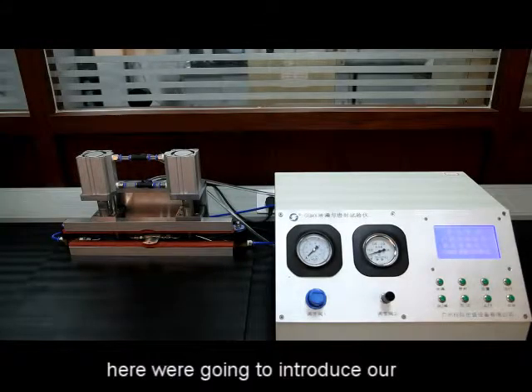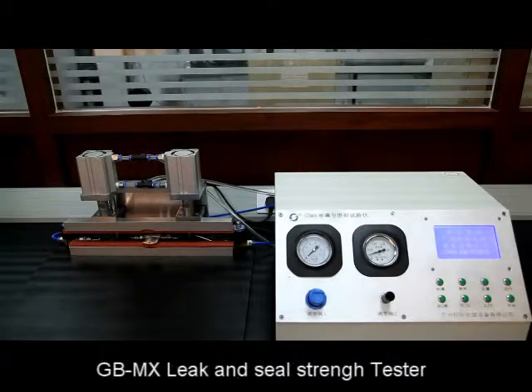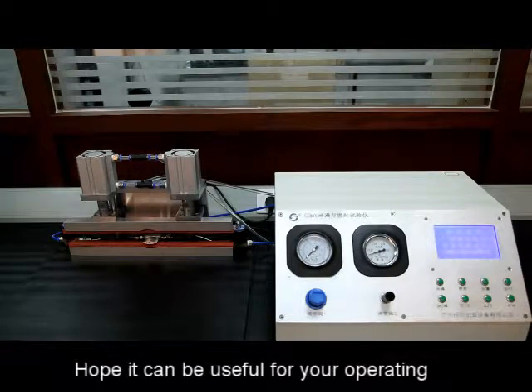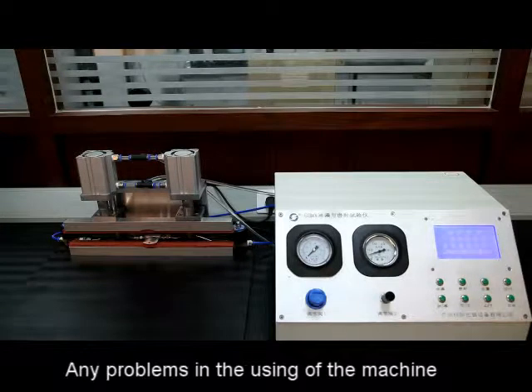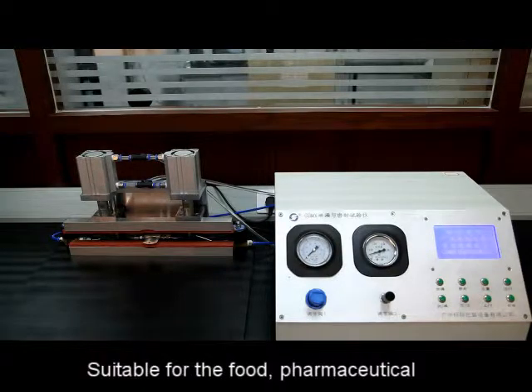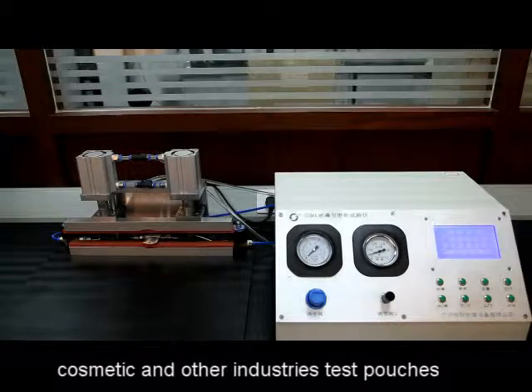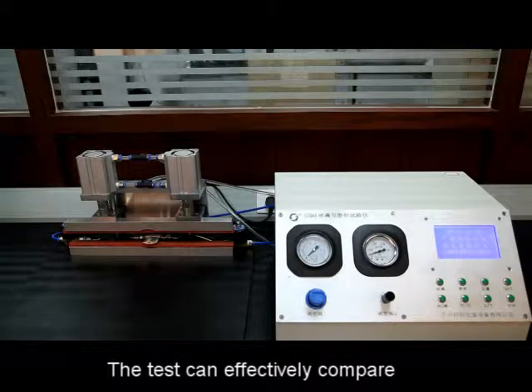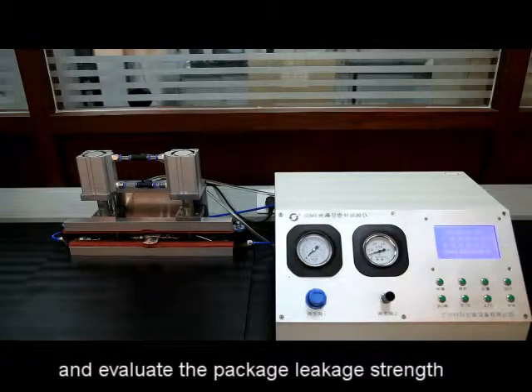Dear customer, here we are going to introduce our GBMX leak and seal strength tester. Hope it can be useful for your operating. Any problems in the using of the machine, please feel free to contact us. It is suitable for the food, pharmaceutical, cosmetic and other industry's test pouches and plastic bottles cans leakage. The test can effectively compare and evaluate the package leak strength.